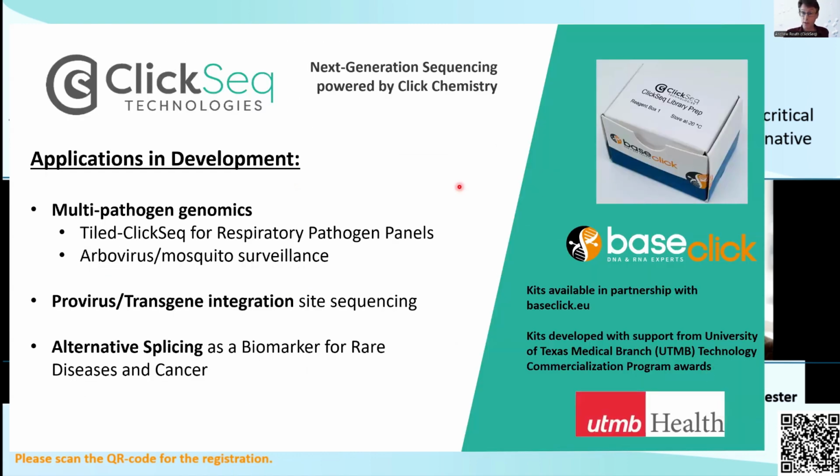And so this was just for SARS-CoV-2. We're now developing these panels. Because we can essentially include as many primers as you want in the reverse transcription reaction, we can start to throw in extra primers. We can look at SARS-CoV-2. We can also simultaneously look at flu or human rhinoviruses, all within the same pot. So with one single reaction, we can actually have a multi-pathogen assay.